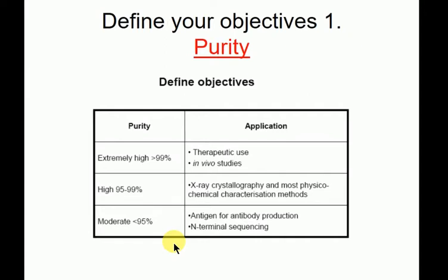So what you could do, and I don't like this, is you could run a gel of your protein. Even if it's a big mix, you cut the band out. And then you've got it in the gel, and then you inject that into the animal. Well, that's not very nice to the animal. So antibody generation is better with more purified proteins, and this is a pretty high-end example of how pure you would need that to be. N-terminal sequencing as well.